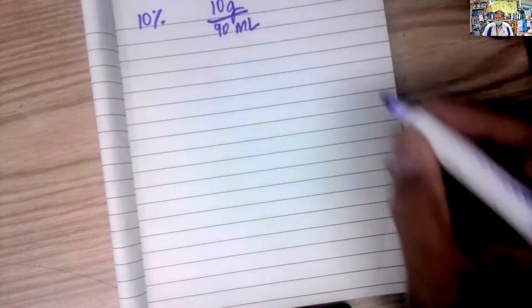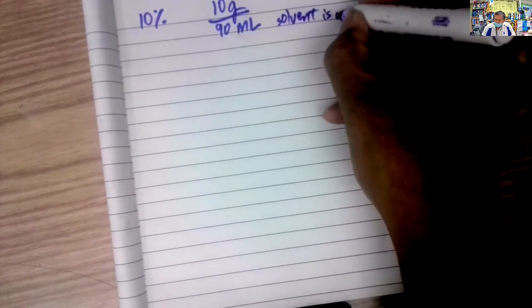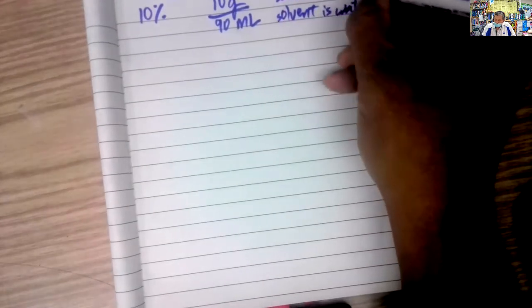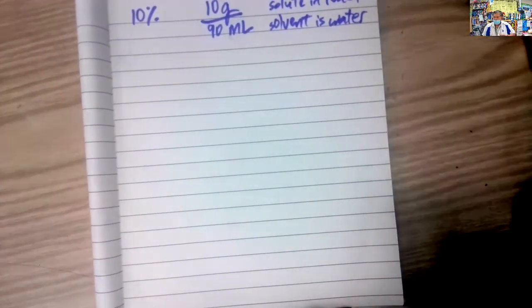but a 10% solution would mean you have 10 grams of a substance in 90 milliliters of the solvent. Now, in this case, the solvent is water. And the stuff that is dissolving is called the solute. And the solute is sodium chloride. So I've got 10 grams of salt in 90 milliliters of water. And if I add that up, it's 100. So that's how we get a 10% solution.